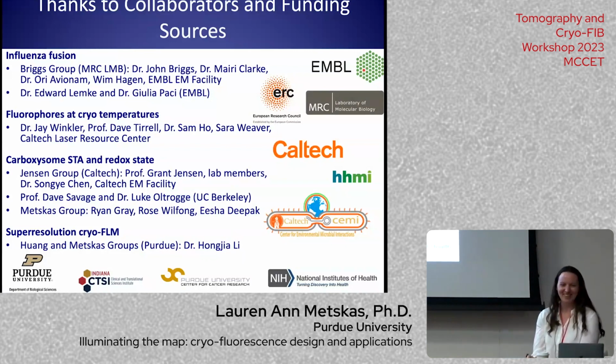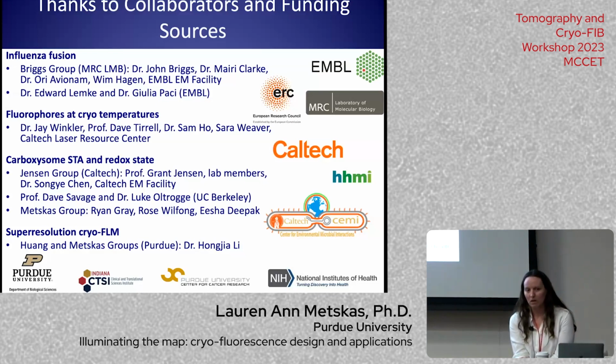Already one question? Thank you. That was wonderful. One question: you mentioned that the spectral properties of a fluorophore change depending on the state of the ice. So emission or lifetime, could that be used to check the quality of the ice on your sample if you know what fluorophore you are looking at? That's an interesting question. It's actually not one that I thought of. If you had the ability to measure lifetime in place, I think the answer would actually be yes. We would have to make sure to separate it out from the chemical solvent effects that also could affect lifetime. But I think it would work.